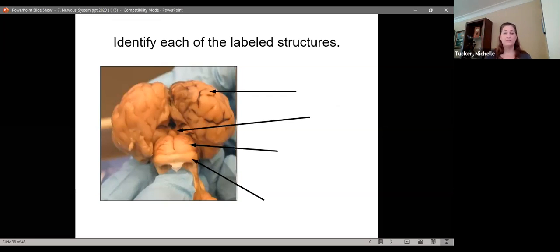Okay, so this one here is a very good view of structures you would find on the dorsal view. So if you put a heart at the pineal gland, and then an arrow at the inferior colliculus. Yep, the bottom structure. And then question marks across the superior colliculus, which are those two, yep, in the middle.